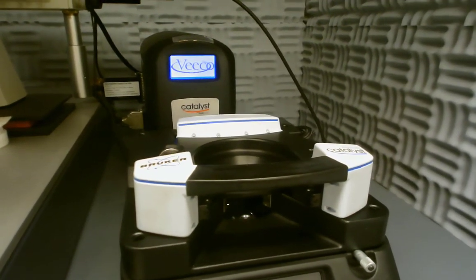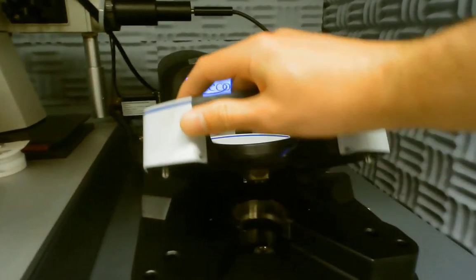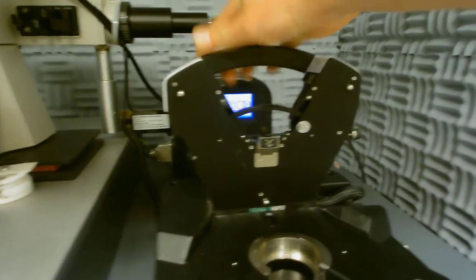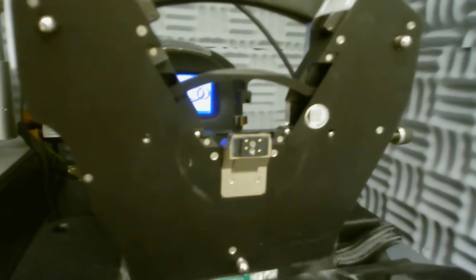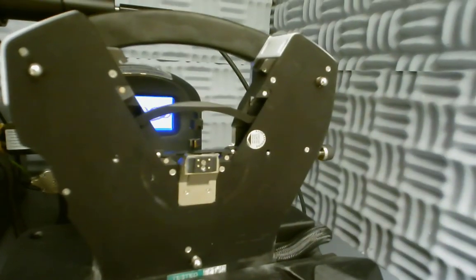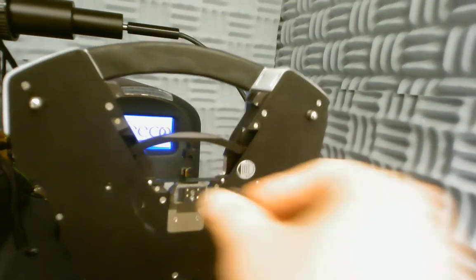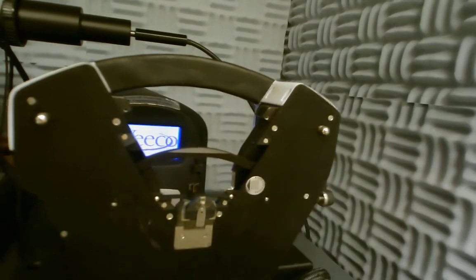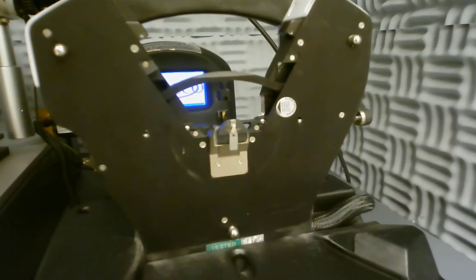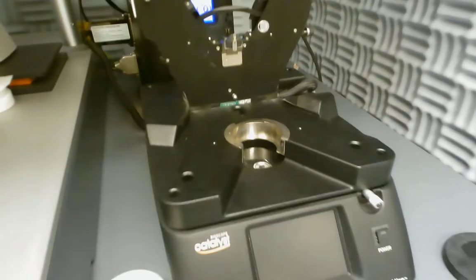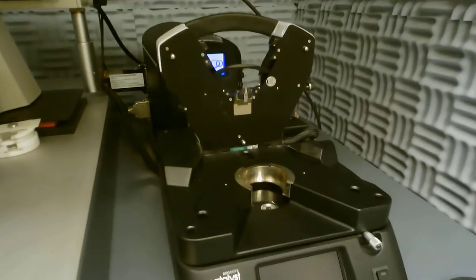This is the cradle that holds the tip. So we tilt it back and the tip holder is mounted here like so. It slides on and is held by a dovetail joint. And then we will use this camera down below to help align the laser and the tip.